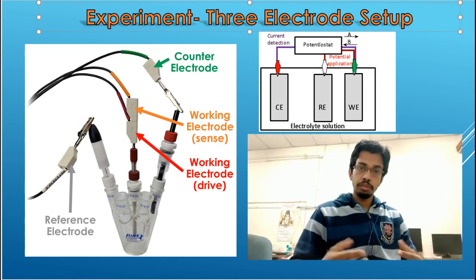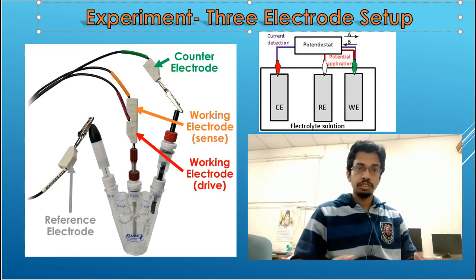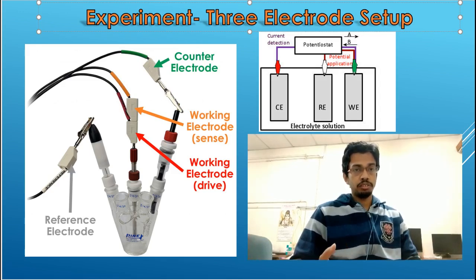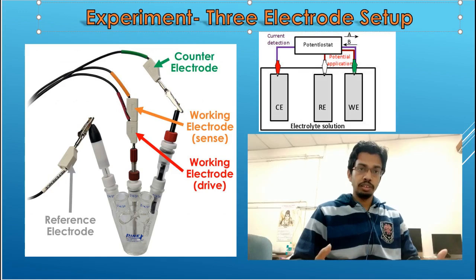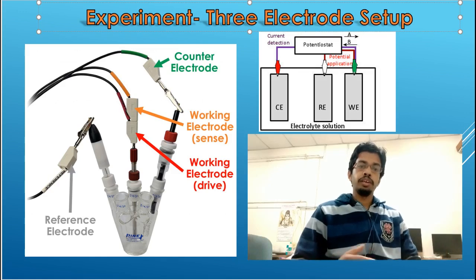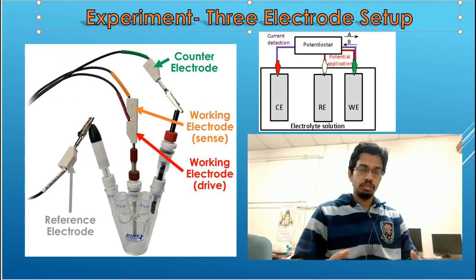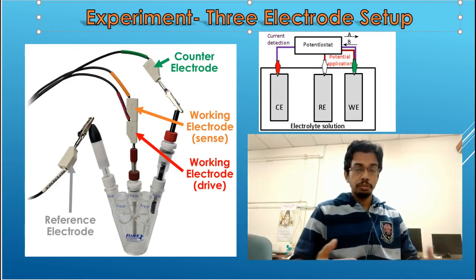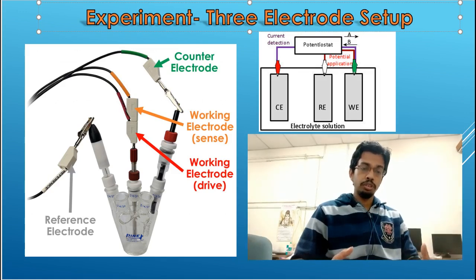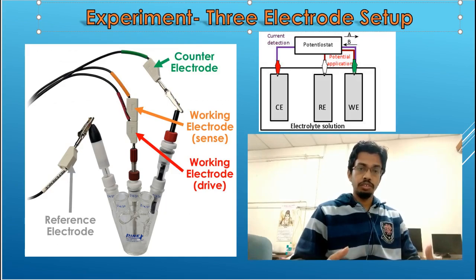The basic electrode setup is similar to a potentiodynamic polarization test — one reference electrode, counter electrode, and working electrode. The nature of this test is non-destructive. Therefore, before performing a potentiodynamic polarization test, you can actually run an EIS test first.